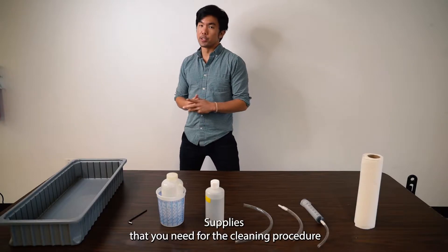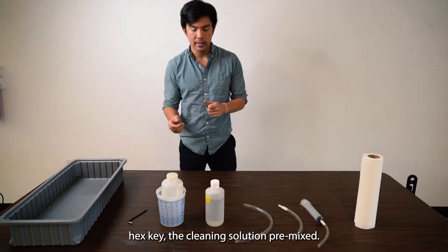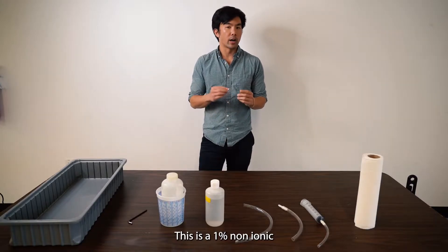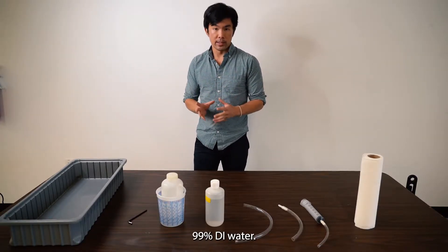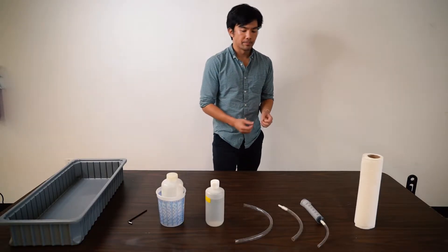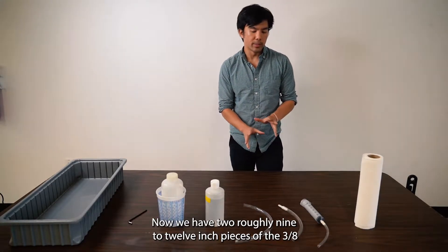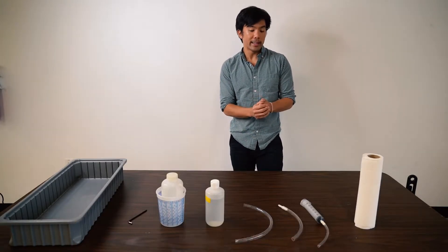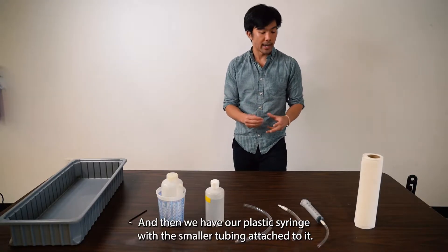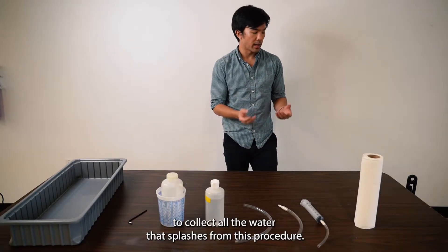Supplies that you'll need for the cleaning procedure are a bin to catch the effluent, a 5/32 inch hex key, the cleaning solution pre-mixed — this is a 1% non-ionic surfactant in 99% deionized water — a bottle of deionized or clean fresh water, and the tubing from the cleaning kit. We have two roughly 9-12 inch pieces of 3/8 inch inner diameter tubing, and a plastic syringe with smaller tubing attached. I'd also recommend having some paper towels on hand to collect water that splashes during this procedure.